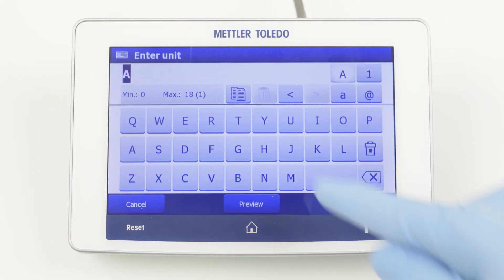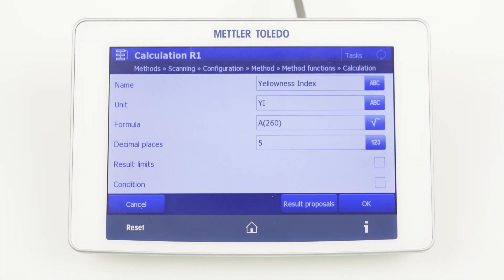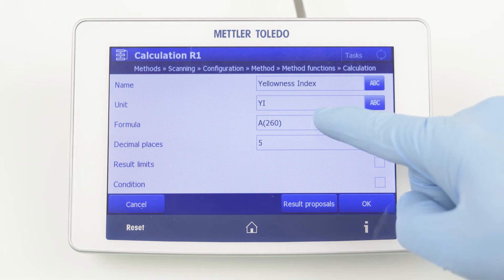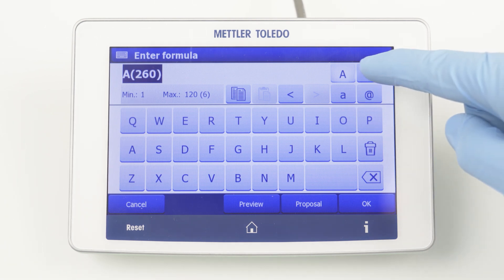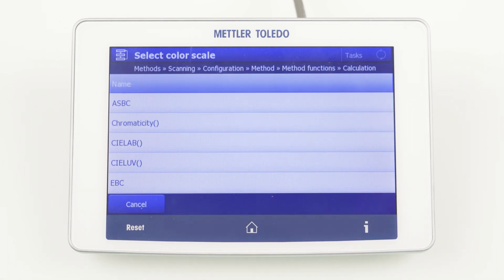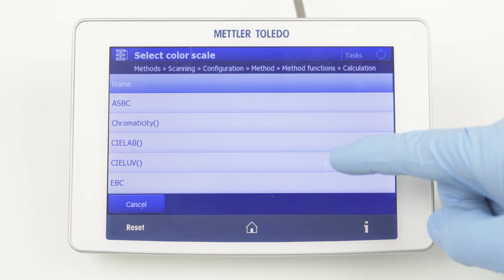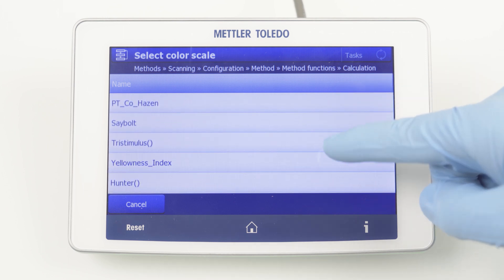As a unit for the yellowness index, we can define YI. By clicking on Formula, you can input a formula. Color calculations are predefined — navigate to the number keyboard on the top right and click C for color. Here you can find the list of all predefined color calculations. All the calculations are defined for a path length of 10 mm. You can select the desired color scale from this list — in this case, Yellowness Index. The correct formula is automatically inserted.